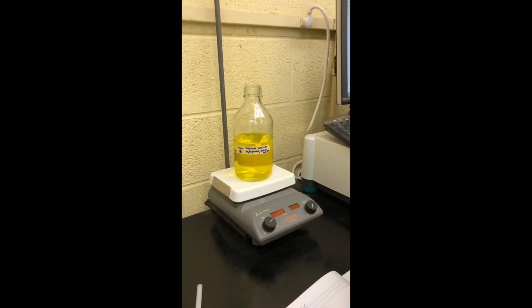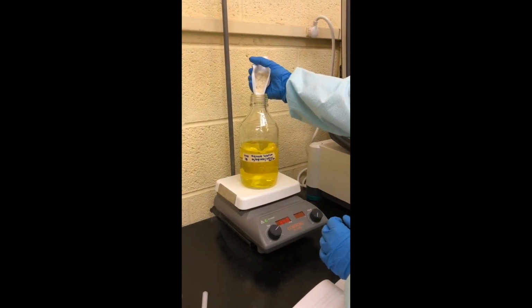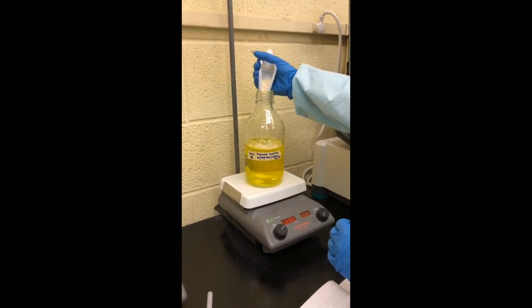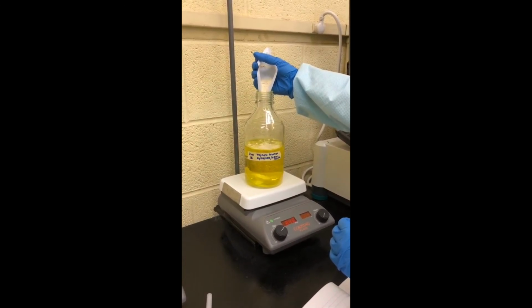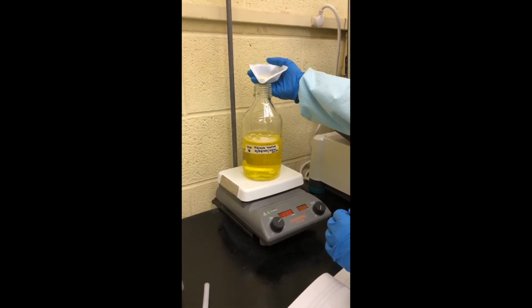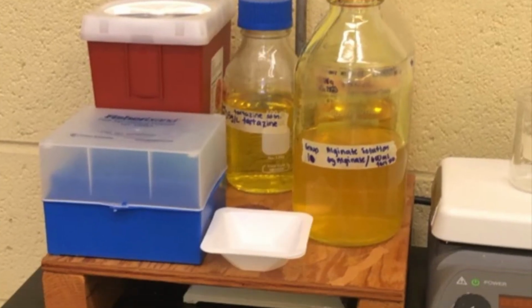The second solution was the alginate solution. In order to make this, we added 0.1 grams of alginate per 10 milliliters of the 0.5 grams per liter tartrazine solution that was made as previously shown. We added a total of 6 grams of alginate into 600 milliliters of the 0.5 tartrazine solution. We let this stir vigorously overnight until a smooth, uniform yellow solution was formed.